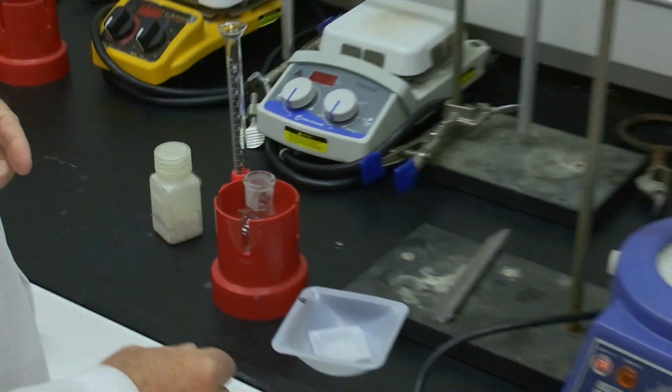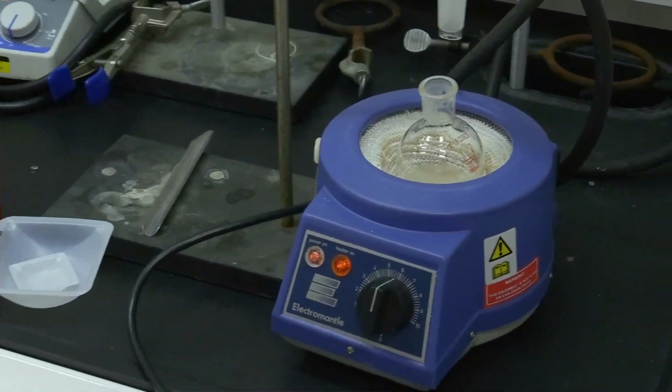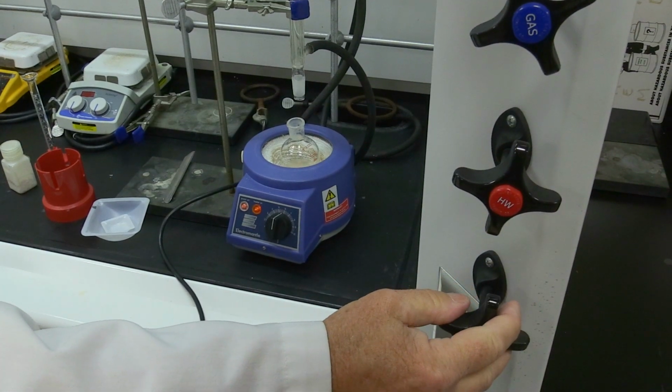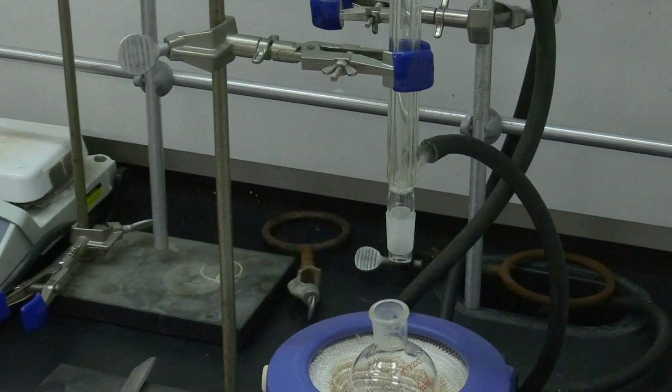Start our heat. Put our vessel in here. Make sure we have nice water flow through the condenser. Nice steady flow.